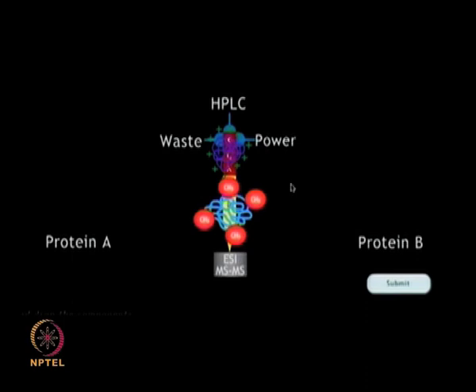So, your answer is correct. You can use the protein properties and separate those in the multidimensional protein identification technology. MudPIT is a non-gel technique to separate and identify individual components of complex protein and peptide mixtures of a proteome. It has been shown that MudPIT has the potential to be used as a substitute for traditional two-dimensional gel electrophoresis, since it can separate peptides in 2D liquid chromatography.